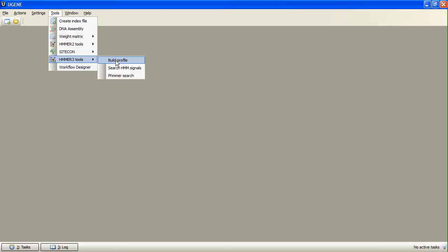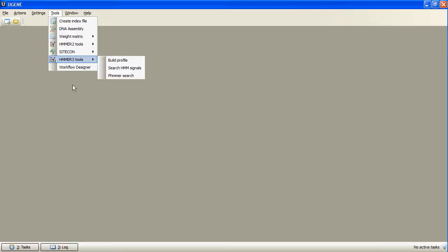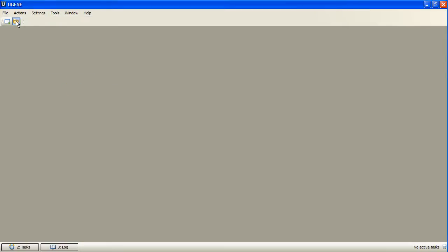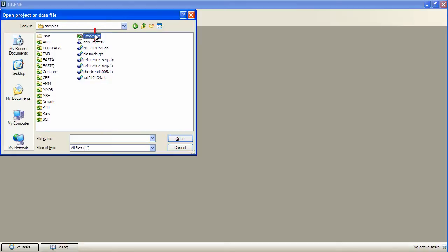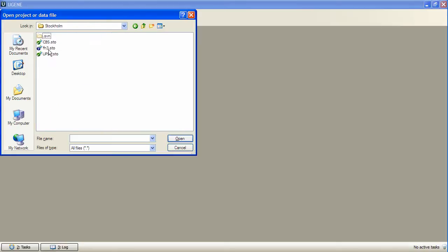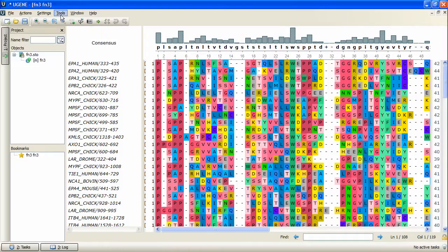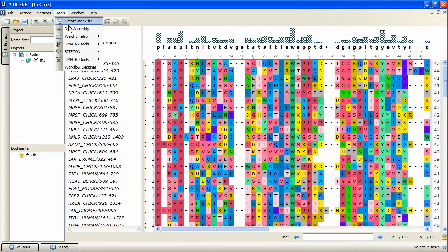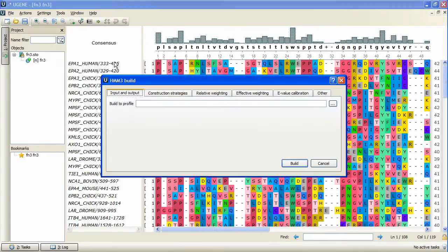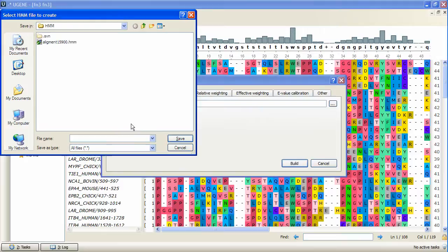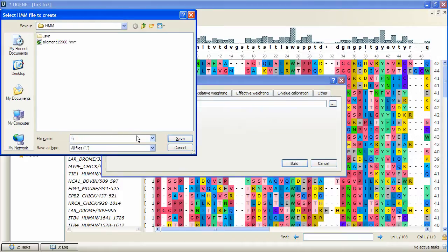Let's open the Stockholm alignment as the input file for the build. Now activate Build Profile item. In the opened dialog box we specify the output profile HMM file for the opened alignment. There is a set of available options.